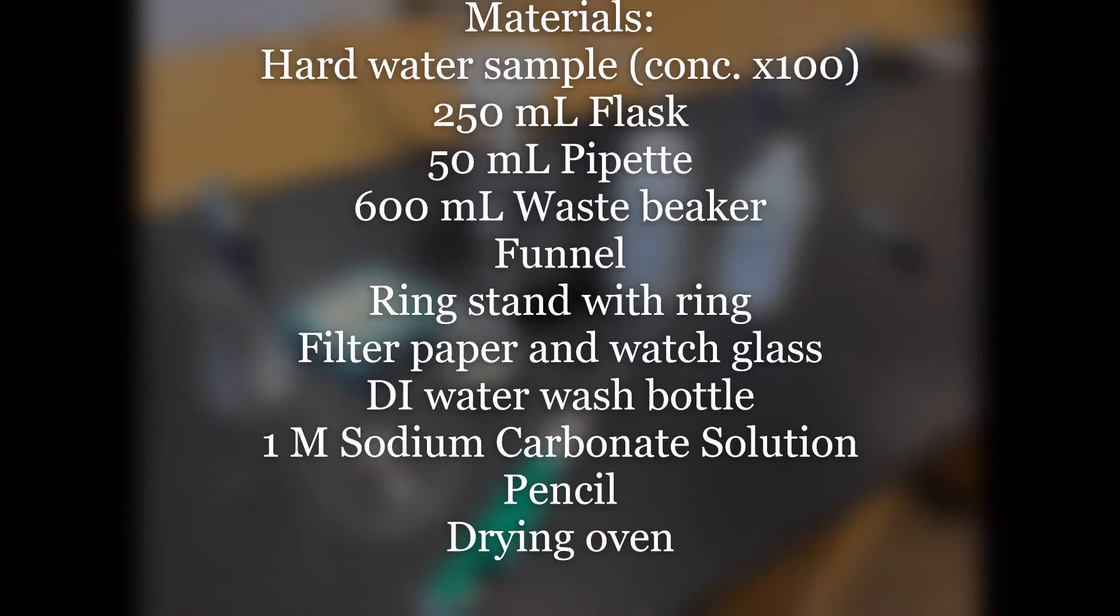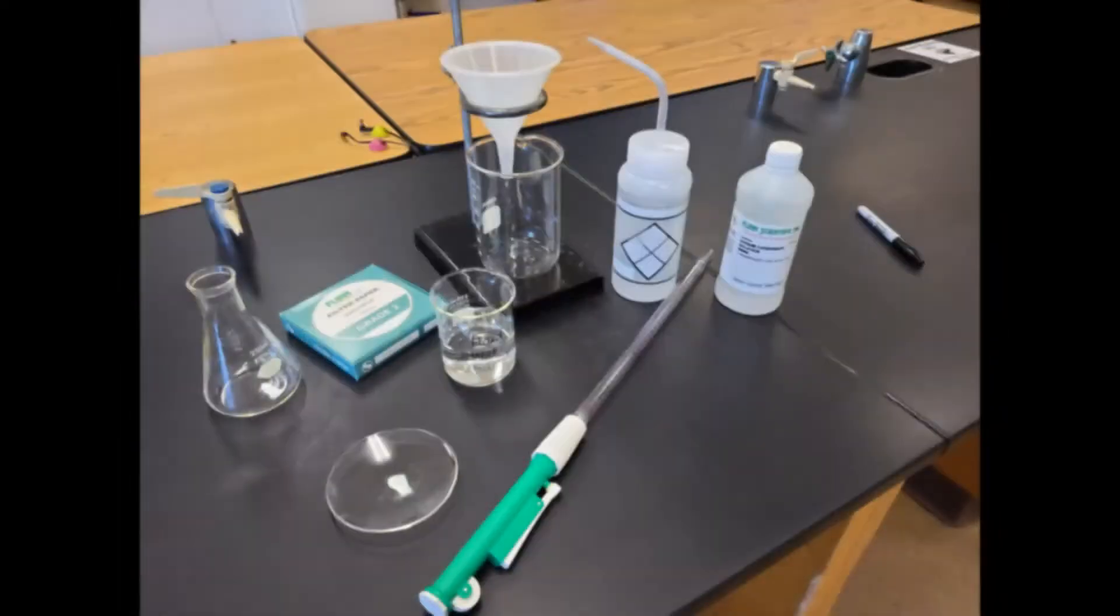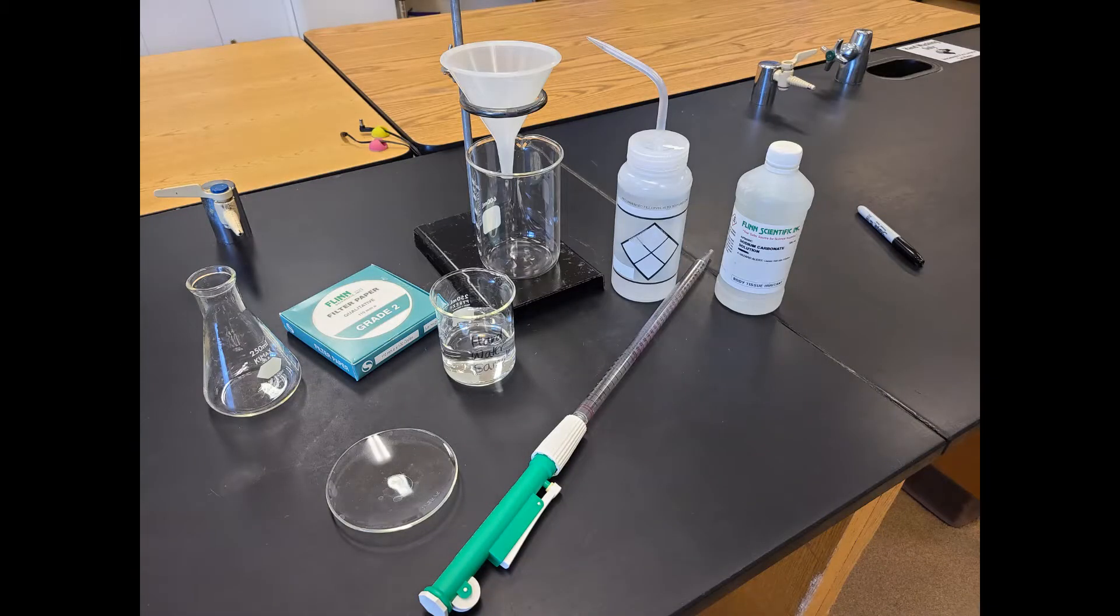Gravimetric analysis. To begin, here is our list of materials that we're going to need, and you see them all pictured for you on the screen.